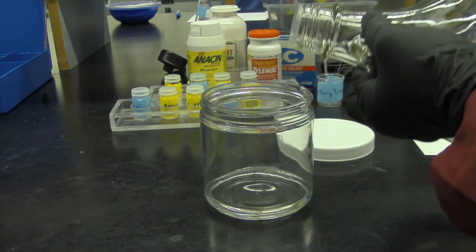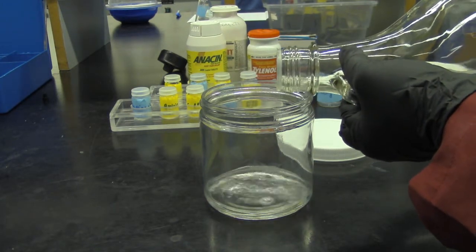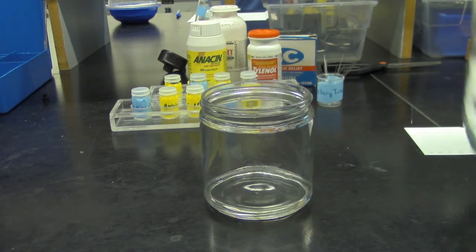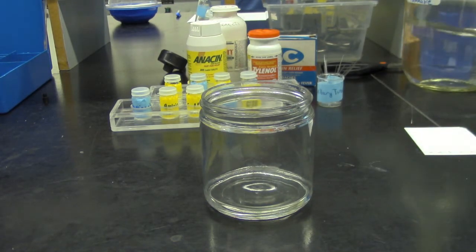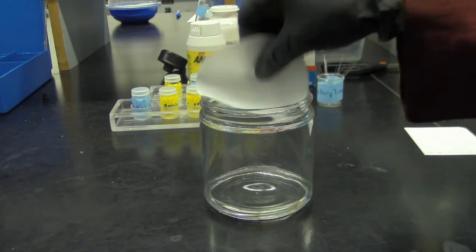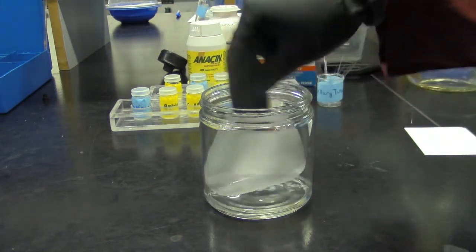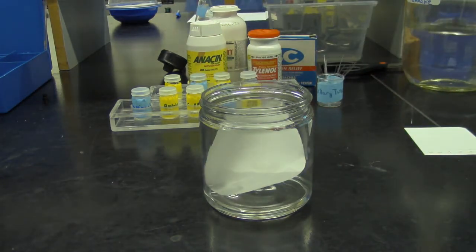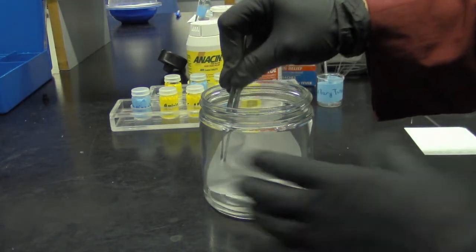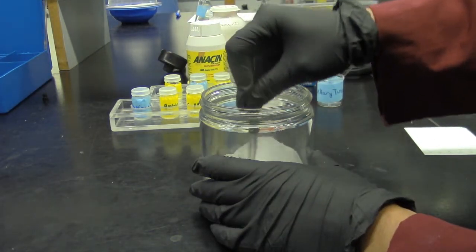I'm just going to add a little more just to cover the TLC plate bottom. Okay, and I'm going to add in a piece of filter paper to saturate the chamber, as well as push it down a little bit. Saturate the chamber with the vapor, right? You want the ethyl acetate vapors.